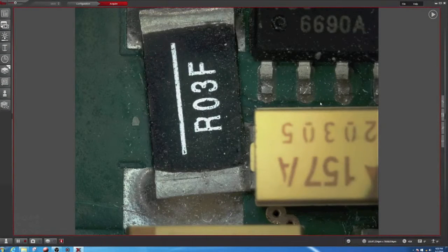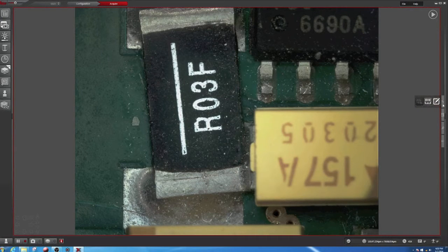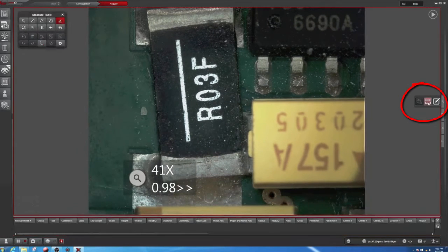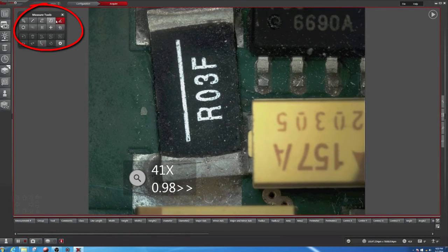Now I want to show you how to make some basic measurements in a live image and how you can export them. On the right side we click on our measure tools, and now on the top left our measure tools will appear.